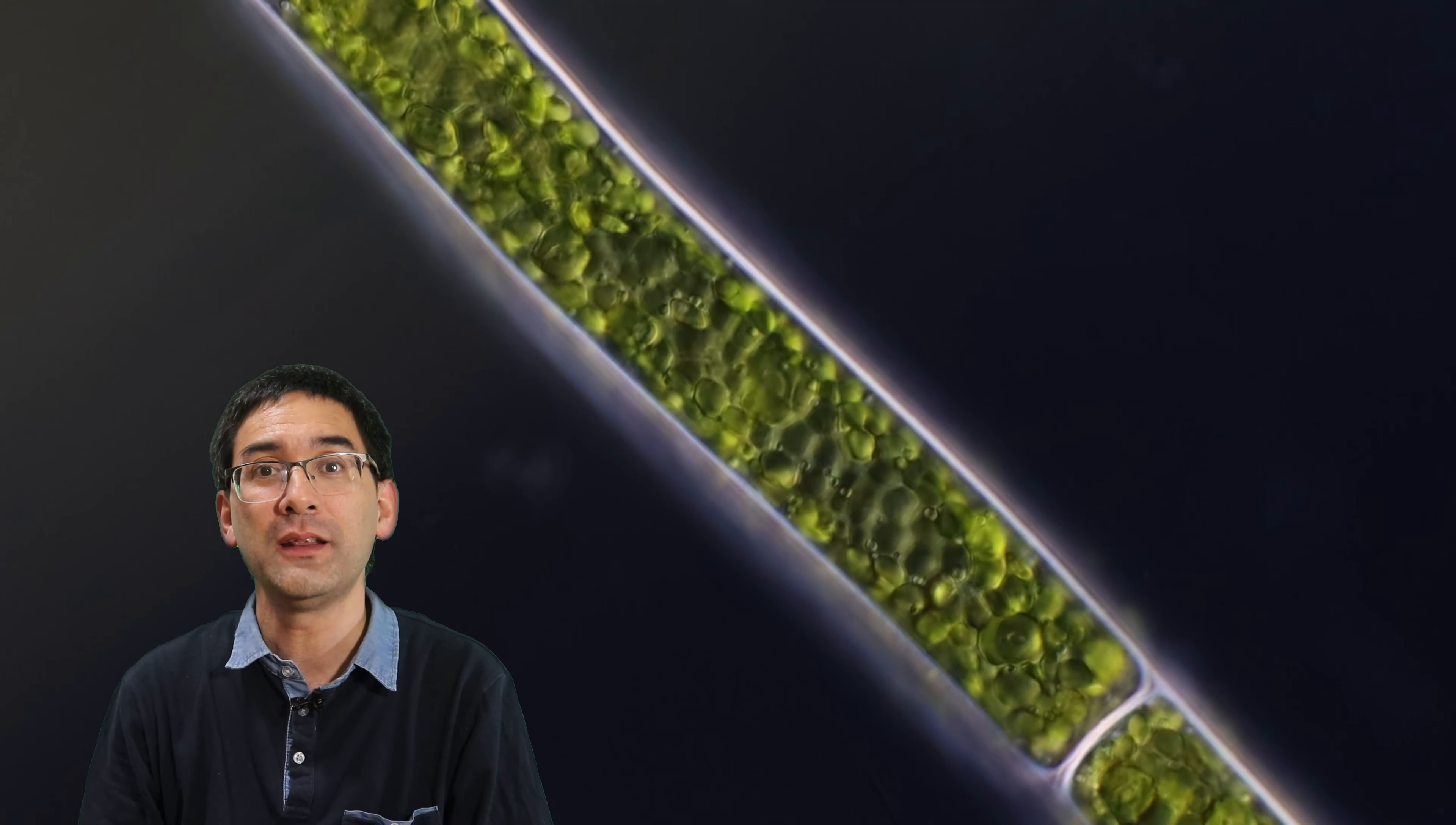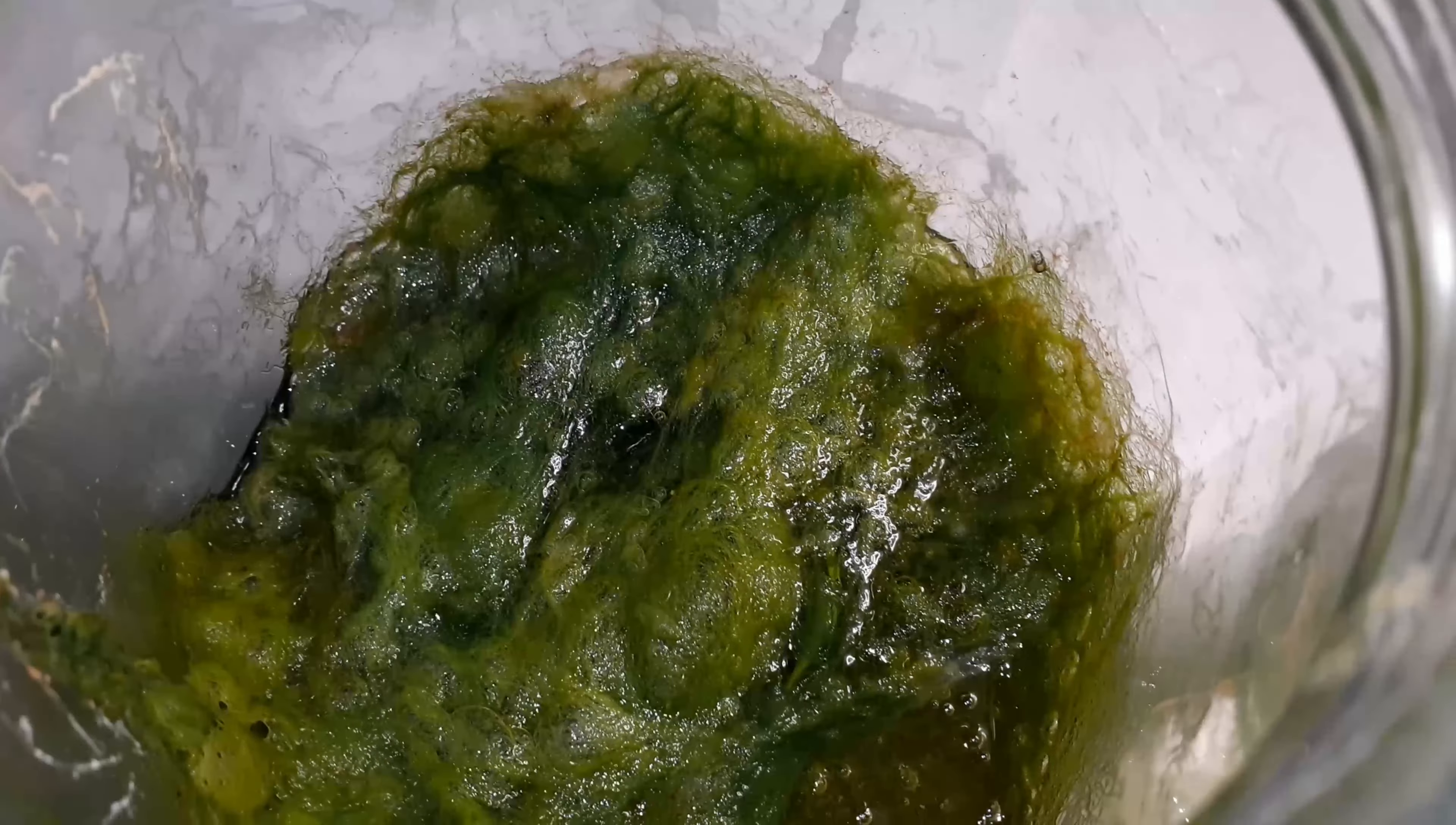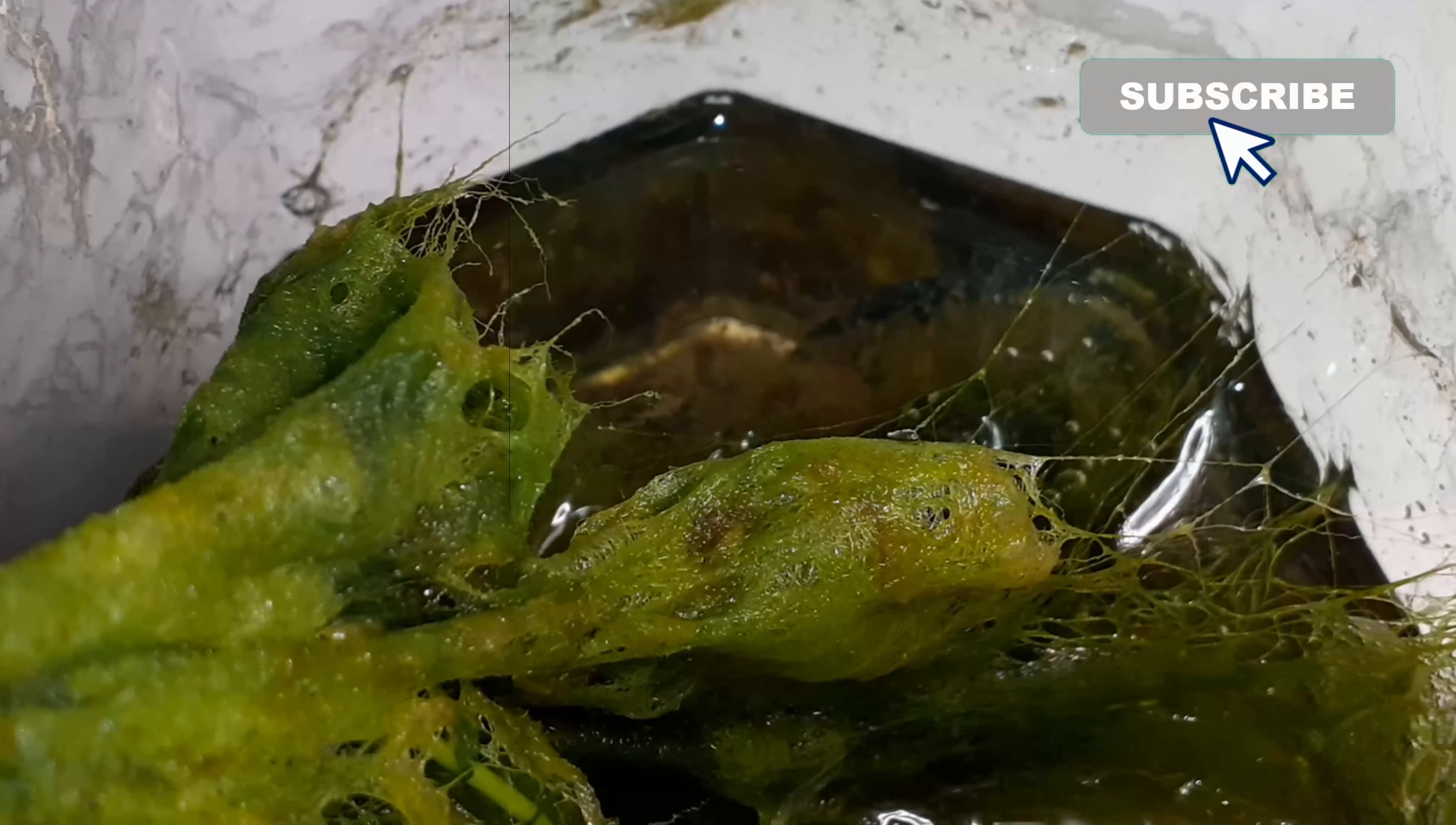These algae look pretty, but they can be a significant problem if too many of them start to grow in ponds and lakes. They sometimes form so-called algae mats, like you can see over here, and they cover the complete surface of the water.